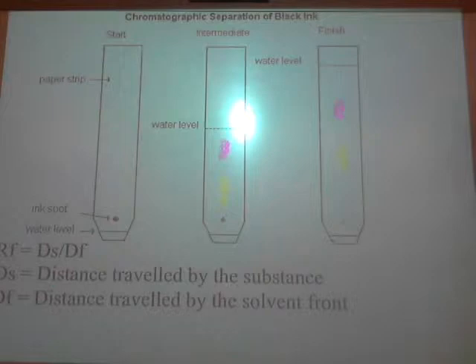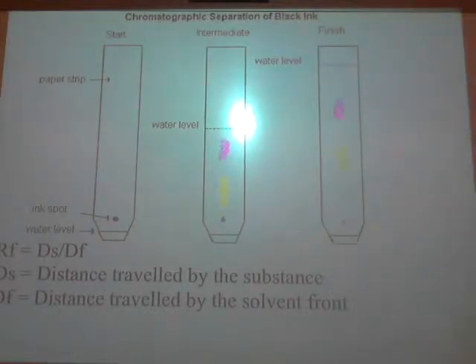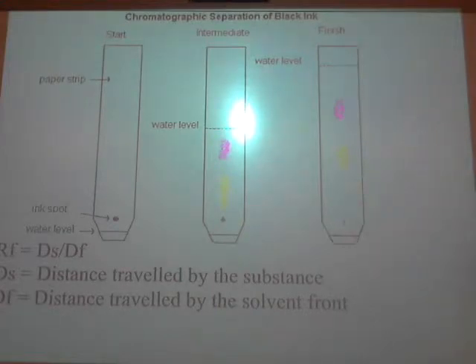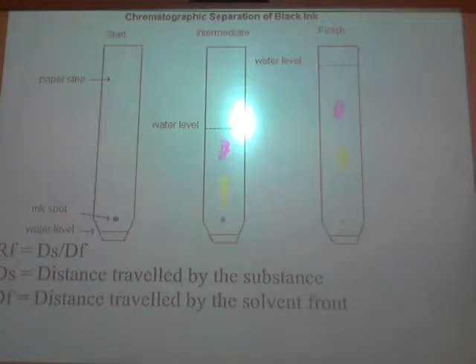Very, very simple. You simply get your ruler out. You measure how far the purple spot went, and then you measure how far the whole water went, and you divide it. If you do that, what's the highest number you could possibly get? It's going to be the distance traveled by the substance over the distance traveled by the solvent. 1. And that can happen. You can actually get 1 if they travel the same distance.